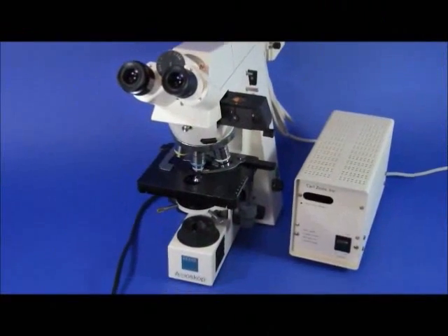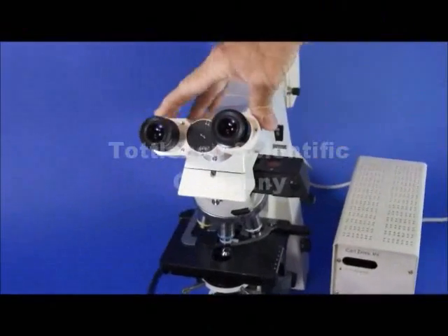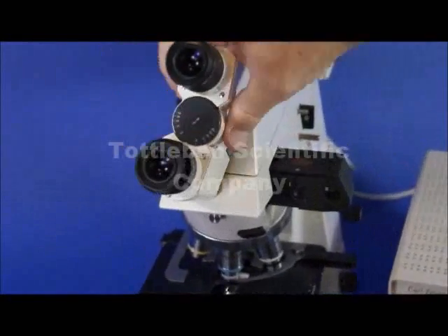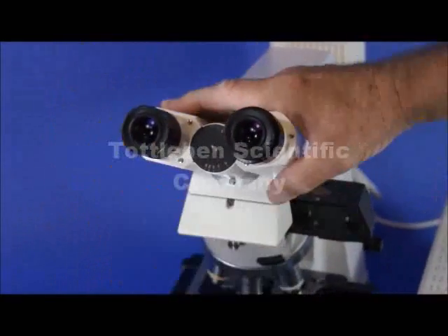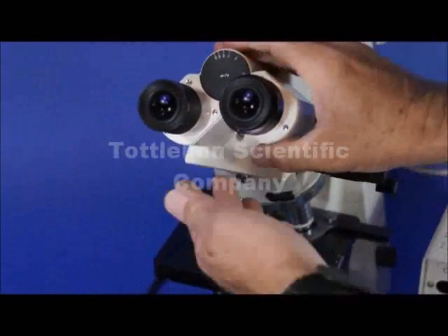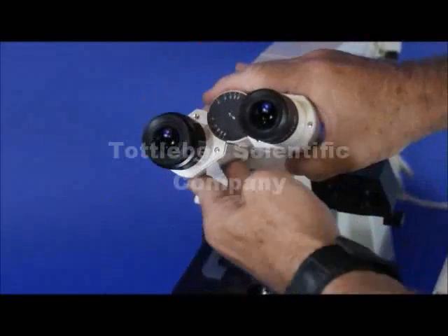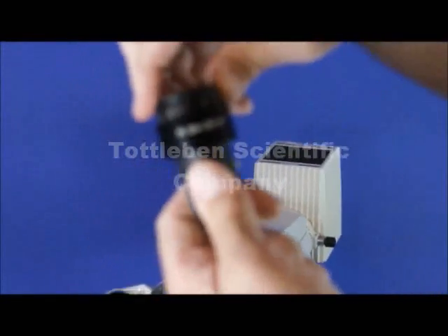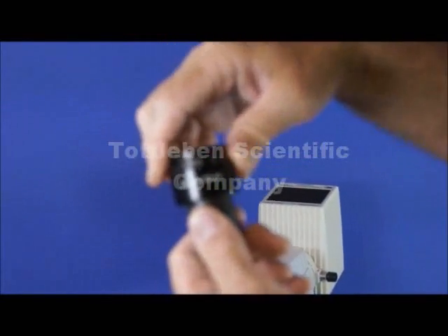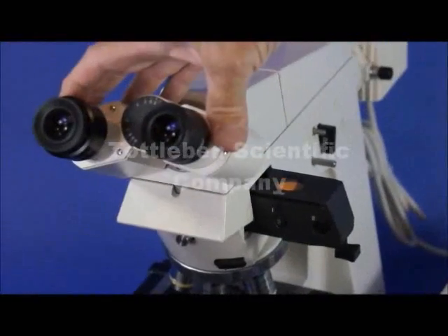This is a Zeiss Axioskop equipped with a lot of goodies. One of them is this 360° rotatable binocular head, which is very useful for accommodating different heights, so you don't really need an inclinable head. It has a really nice swivel 360° head and on the left side a focusable diopter eyepiece — a PL10X, 20 field number — accommodated for eyeglass wearers, so you can accommodate different visual acuities and remain parfocal.